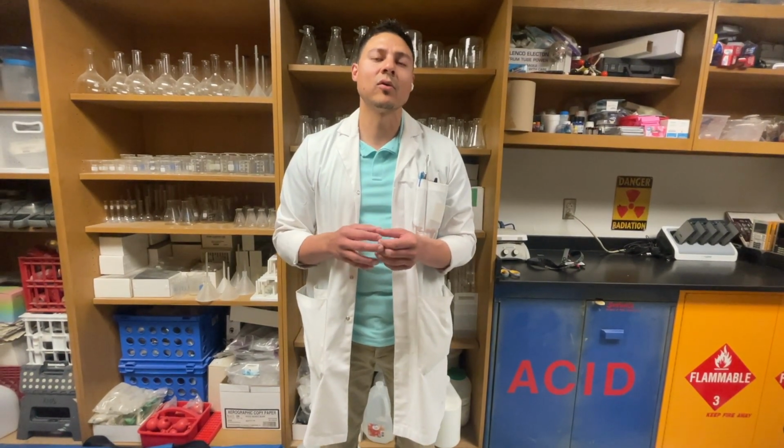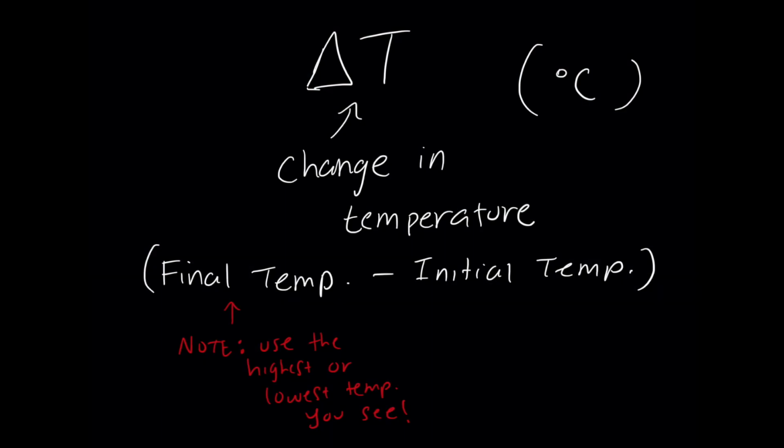So this is also known as a calorimeter. It has that word calor, or heat, and we're measuring the heat changes inside this chamber, or this isolated system, so that we can determine if we have an exothermic or endothermic process.